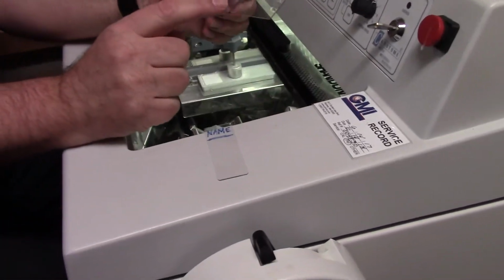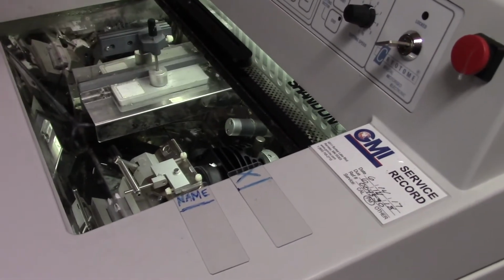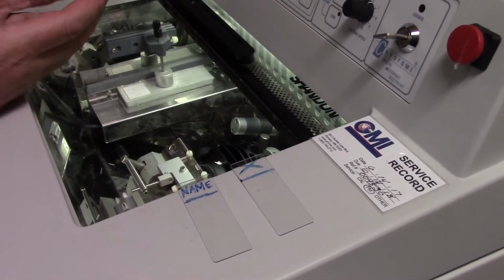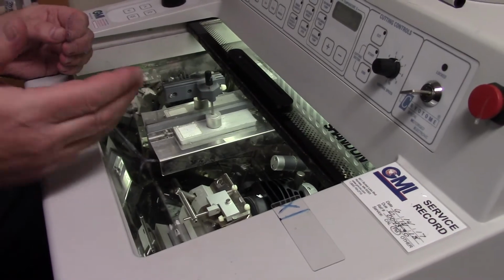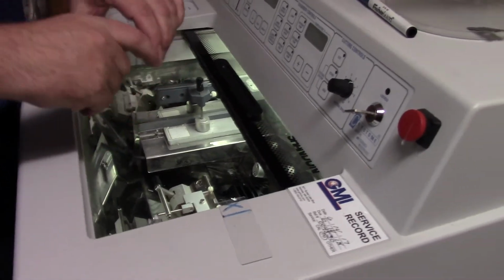Now, the first one I put on my negative control slide. Now, this is only 20 microns next. So in salamanders, they have very large cells. This could be the very next cell over, which, if it was part of the blastema, it's still going to be part of the blastema. If it's part of the muscle, it's still going to be part of the muscle. So now I'm going to pick this next one up left-handed.